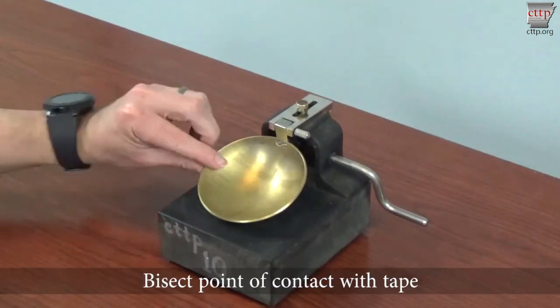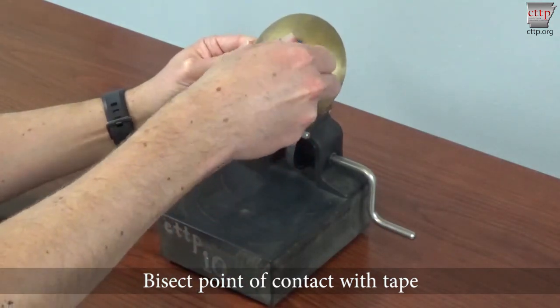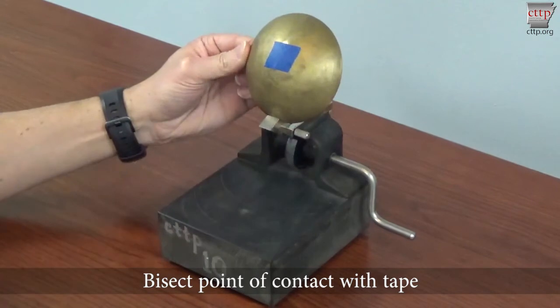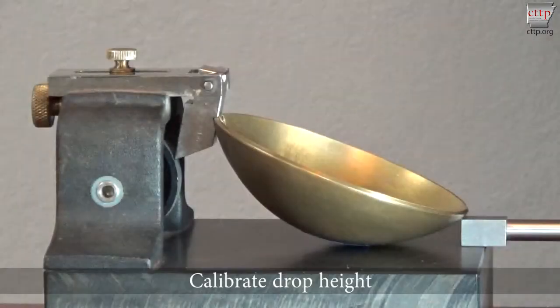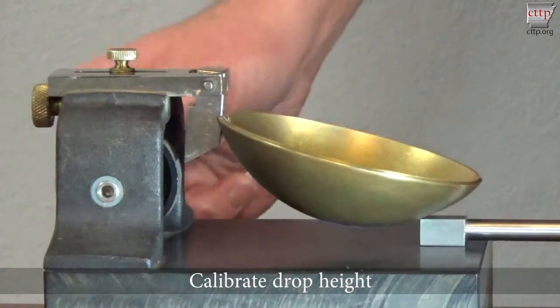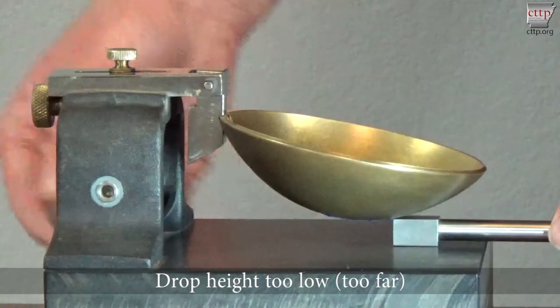Verify the cup drop height daily. To do this, flip the cup up and place a piece of masking tape on the bottom of the cup so that a straight edge of the tape bisects the point of contact on the cup. Lower the cup to the base and slide the gauge block between the base and the cup along the grooving line until the gauge block contacts the edge of the tape.